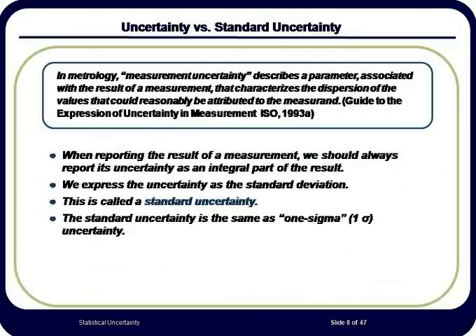The definition of uncertainty according to the Guide to the Expression of Uncertainty in Measurement is quoted on this slide. Since every measurement has an associated uncertainty, any result must be reported with either a calculated or an estimated uncertainty. Always. Reporting the uncertainty with the measurement allows the data user to have a certain level of confidence of how closely the value reported represents the true value.